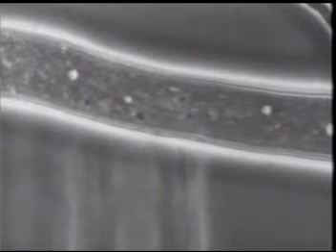If there is an abrupt flow, the crystals are detached and lodged in the septal pore, plugging it off. This constitutes Neurospora's method of wound healing.